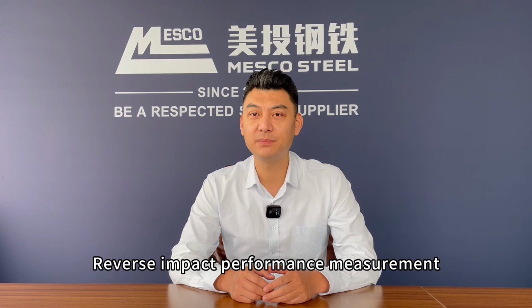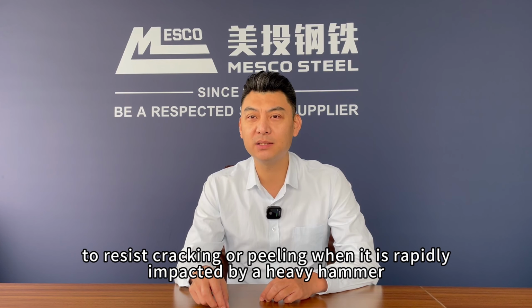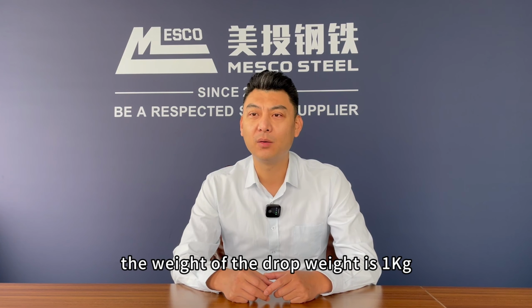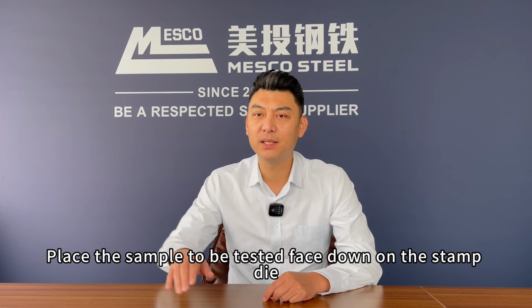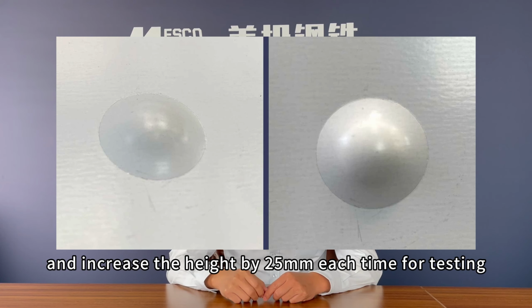Reverse impact performance measurement. Reverse impact energy is a dynamic test that evaluates the coating's ability to resist cracking or peeling when it is rapidly impacted by a heavy hammer. Take a sample not less than 75 mm by 150 mm. The weight of the drop weight is 1 kg, and the diameter of the punch is 15.87 mm. Place the sample to be tested face down on the stamp die. Let the weight drop from a certain height, and increase the height by 25 mm each time for testing.